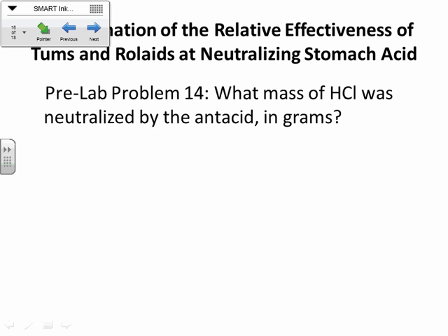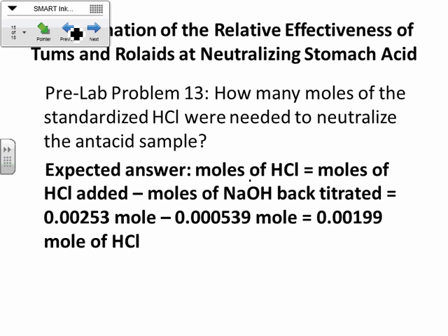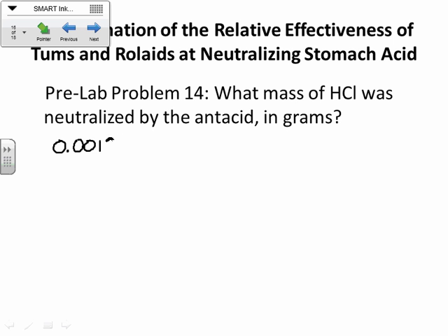So you've got the mass of the HCl. You want to know how much was neutralized by the antacid in grams. Well, it's not that hard to go from moles to mass, right? So we've got, I forgot the number already, 0.00199 moles of HCl.